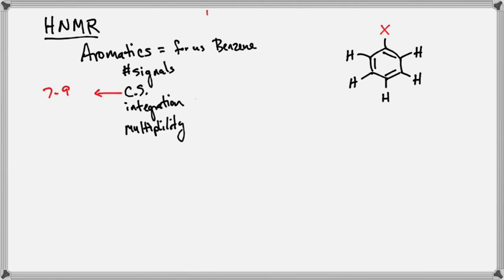Real swiftly, what if I look at the integration and it comes in at 4? You have an X in between a hydrogen or 2 X's. So be careful. For the sake of the recording, people are going, oh, I have an X, and now trying to tell me where the X is. You have to be real careful with that because you're telling me a placement.